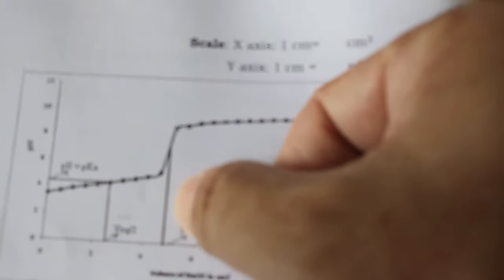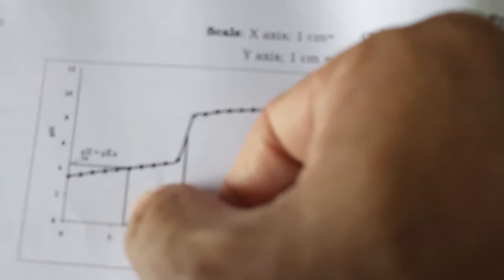We can take exactly half of this. For example, if this is 4, at 2 we can take the half of the equivalent. When we read from the y-axis, that is equal to pH, that is equal to pKa. For weak acids at half neutralization, pH is equal to pKa.